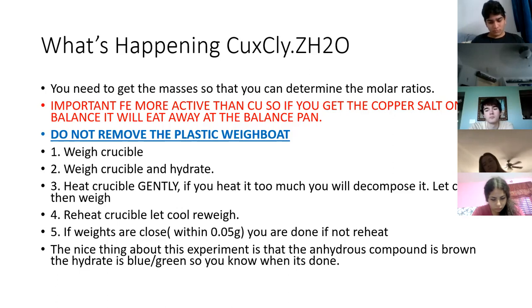Now we're going to do something super silly. We're going to put the water back in. The nice thing about this experiment is you can tell when all the water's been driven off, because the hydrate will be a nice greenish blue color. The anhydrous is brown. So when you get all brown crystals, you can be fairly sure that you've driven all the water off. So we're going to put that compound into water, and we're going to make this nice blue solution.